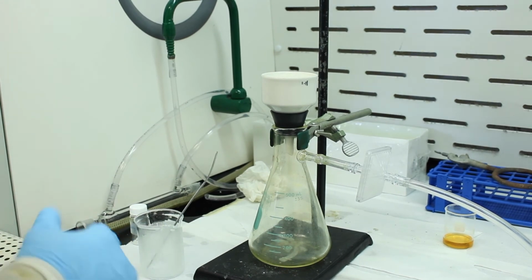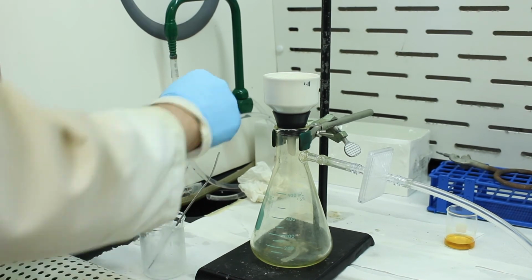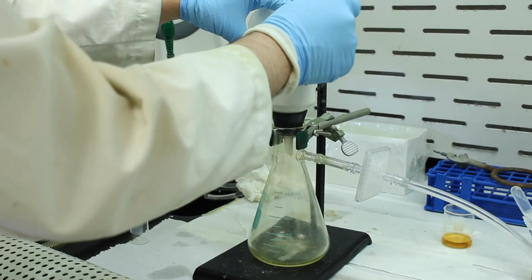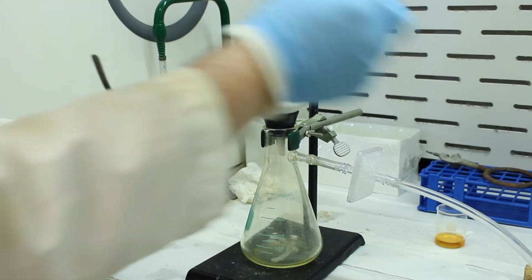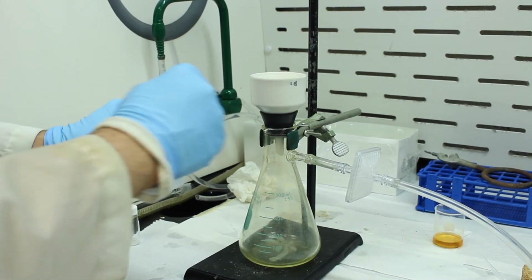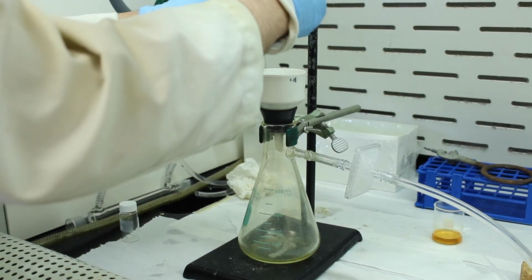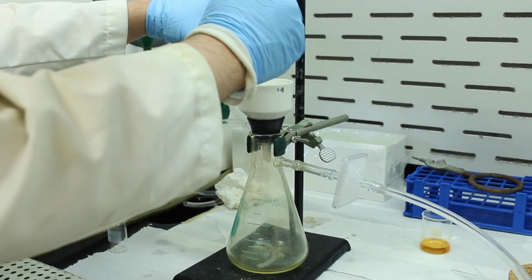So we'll use the hexane in here to rinse out the beaker. Okay, then we can add the remainder of the hexane. And then this will serve to wash out any residual biphenyl.